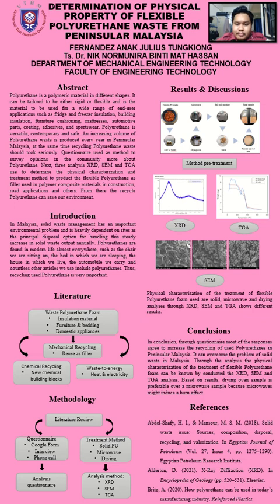Then next, I use the three analyses, that is XRD, SEM, TGA, where before that I use a treatment method to convert solid PU to powder by using microwave and drying. Okay.